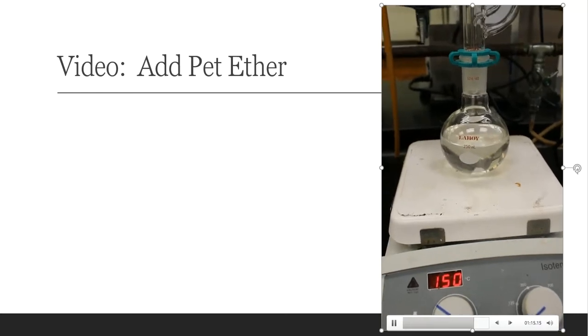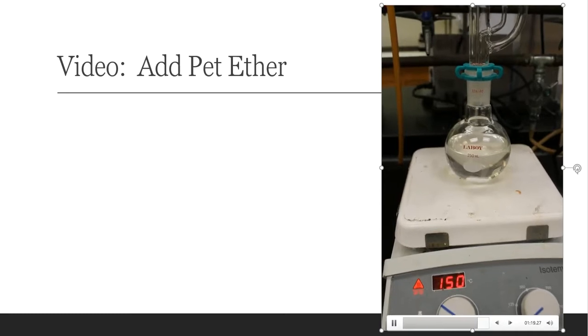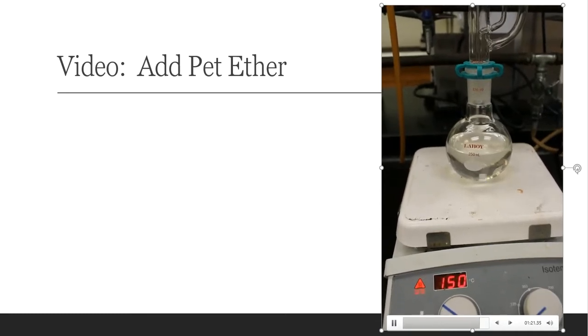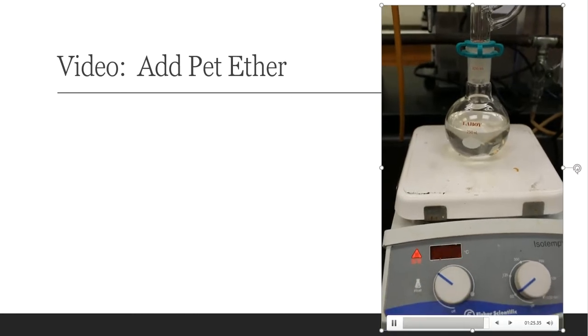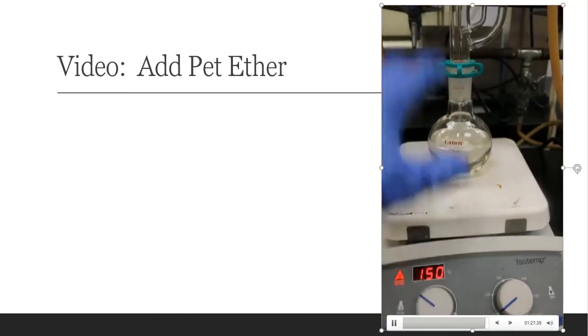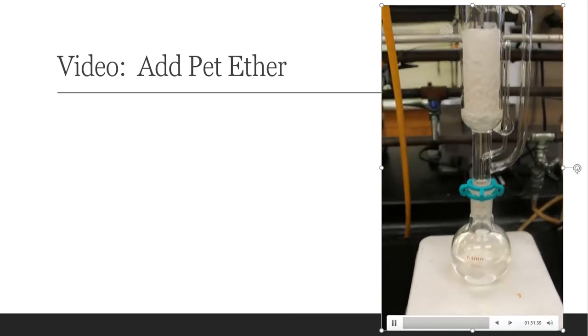Okay, so I'm going to come back 2 days later. 2 days, that's right. That's how long this process takes. And I'm going to keep checking on my ether layers to make sure that it is full and that more can still go into the Soxhlet from up above.